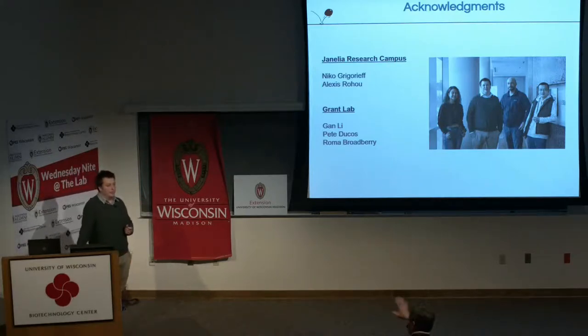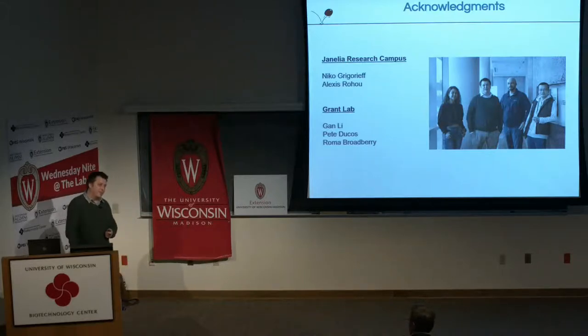And the second question has to do with the higher dosage where you're starting to actually fry your sample. There's something analogous that can happen in crystallography, as you point out, and it tends to have a sequence dependence. So, for example, you can actually decapitate methionines as a function of data collection. Is there any analogous piece here where you could pull sequence information by looking for sensitivity of some portions of a molecule versus others, so you could actually start to say, that's probably a methionine?